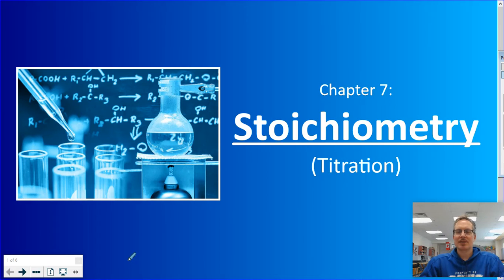Good morning, Chem 20s. Our lesson today is on titration. This is a continuation of solution stoichiometry, where we're going to be applying that technique into a laboratory setting.